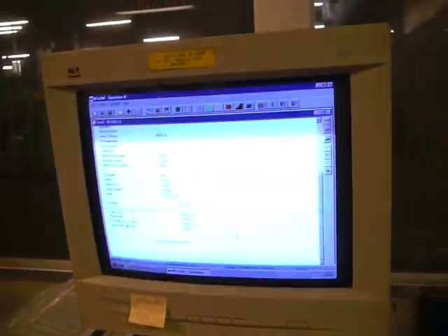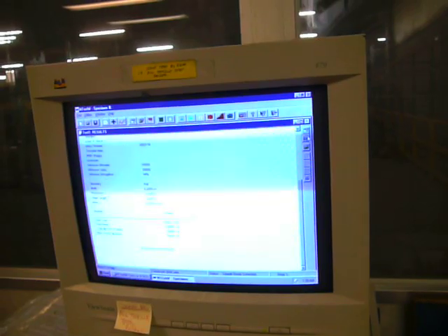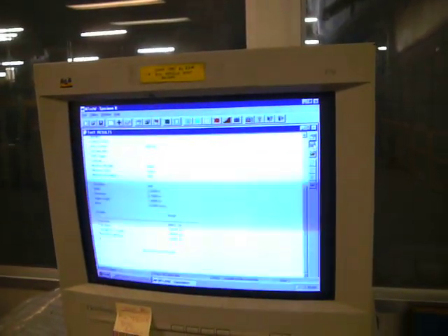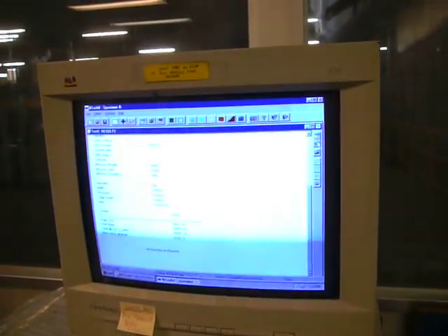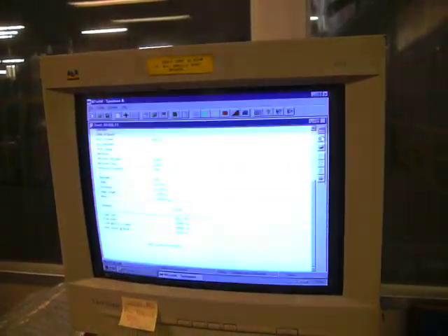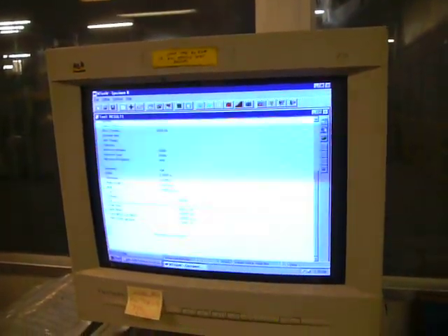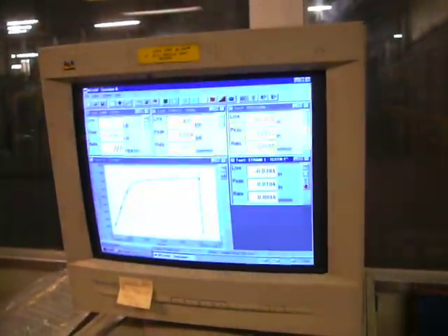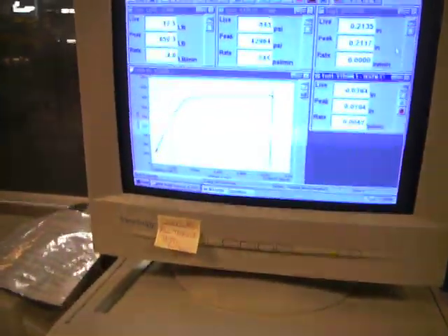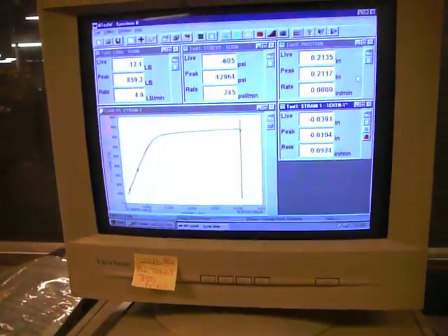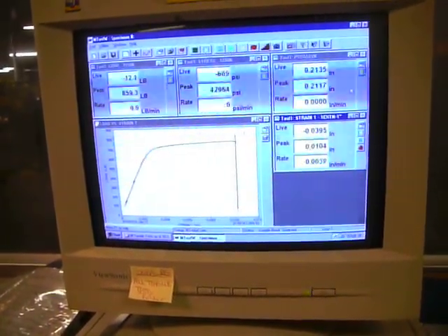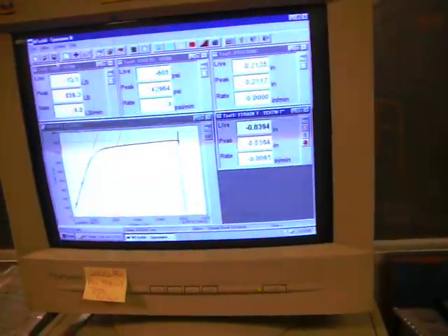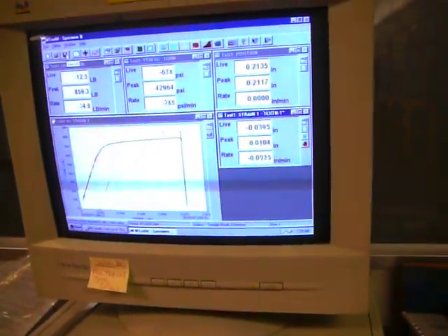And then you can print this? Yep. And then we can go up to the print button and print. Hit the space bar. And it'll show the graph on the computer too. You can also print that? It will print.